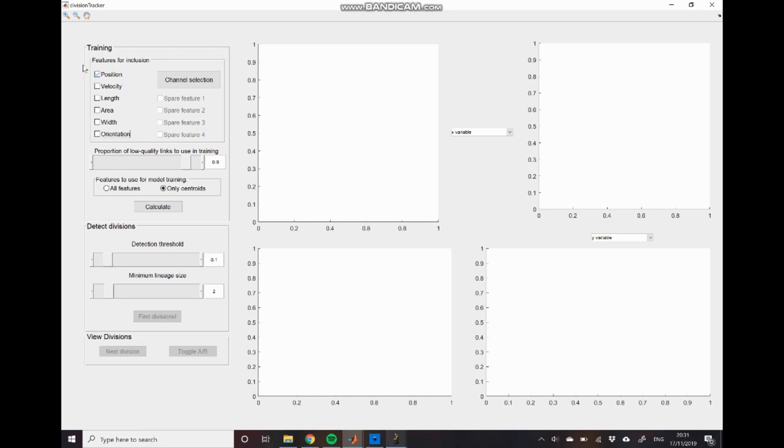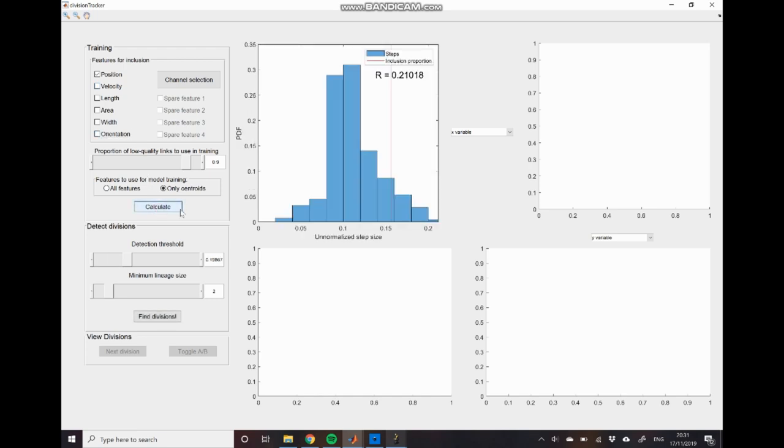So I'll just click calculate and you can see that we get this unnormalized step size distribution which looks very similar to that that we saw in the previous GUI. We also have this trackability score which isn't very useful by itself. Instead we're going to be relying more on these other windows for our validation of the division detection.